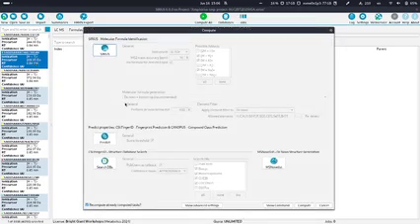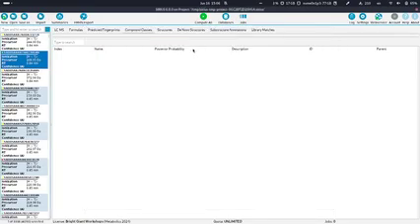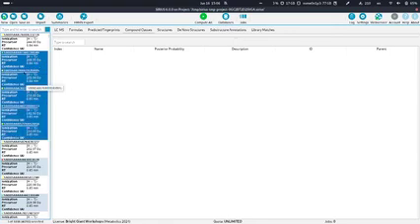Just to show this first, because this will look a little bit different than what I will show you soon, which is when you select multiple compounds or just click the compute all button at the top. So this would be only for one compound, but we'll also do this in one example. But now I want to show you how it looks for many compounds.